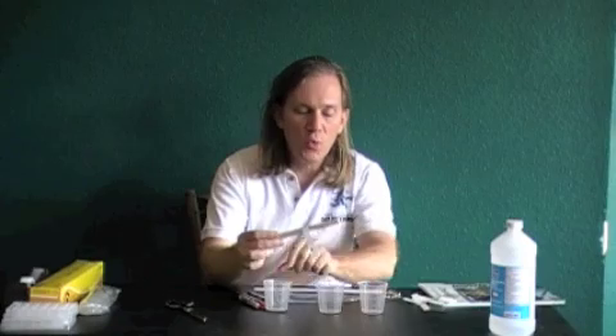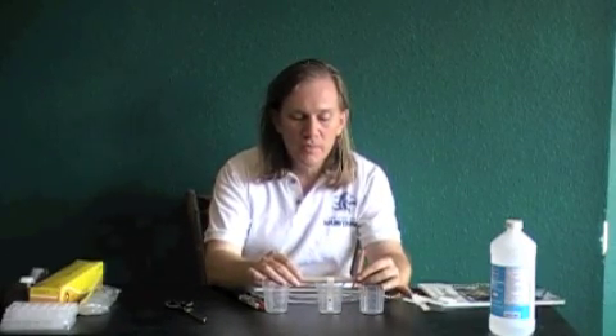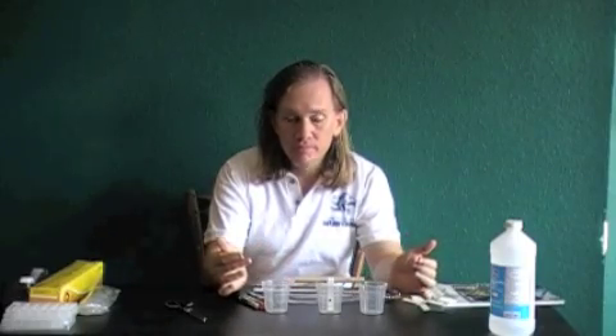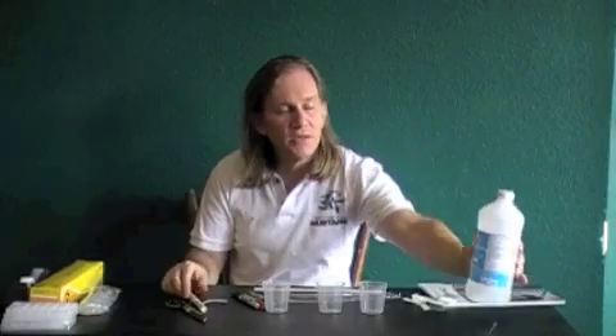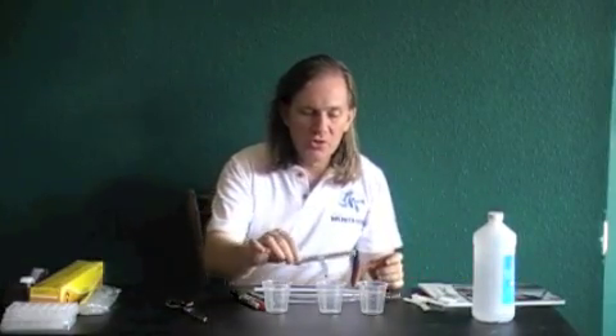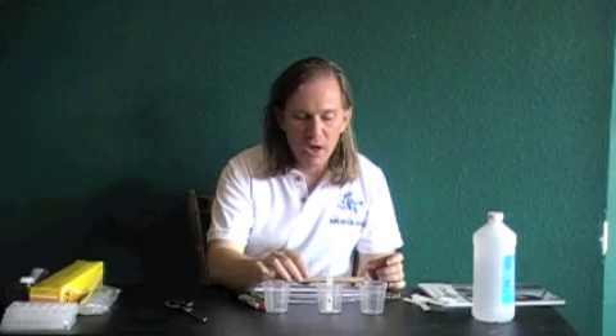You're going to tape the top of the paper down to the dowel so that when it goes into the beaker, it just hits the bottom. You're also going to need some alcohol — rubbing alcohol that you buy at the grocery store. You want the paper to just reach the bottom.